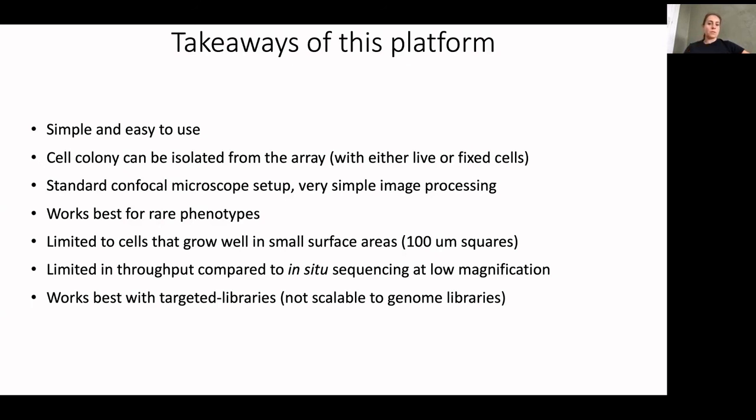And since that's kind of what we were looking for in our screen, the most dramatic reduction phenotypes, it makes a lot of sense that our positive control and G3BP1 itself were the strongest regulators of depletion. And we and others have shown that, for instance, UBAP2L will deplete them again at a level of like 50%, in various different degrees of depletion overall. So I don't think it's that surprising given how many protein components there are in these stress granules.